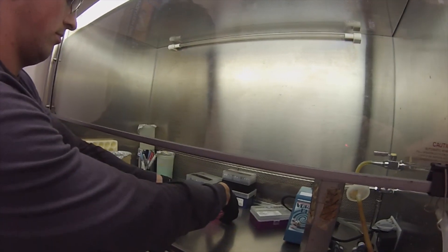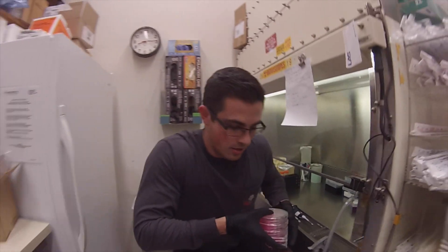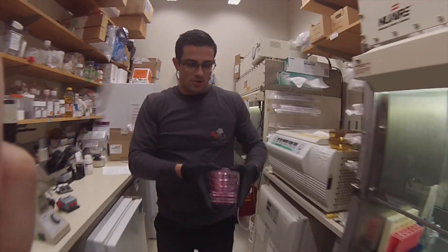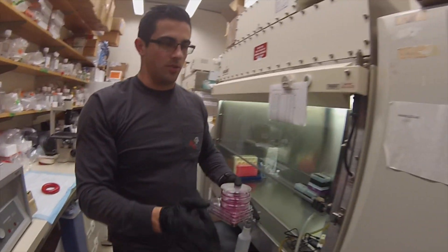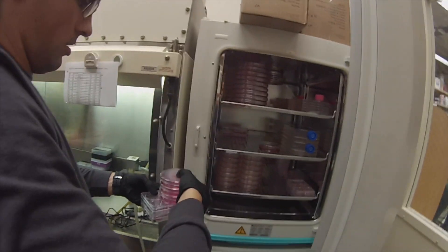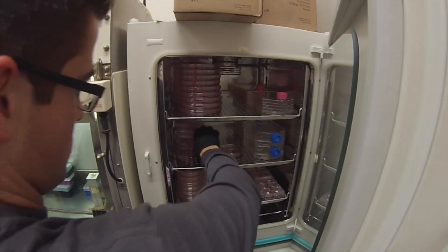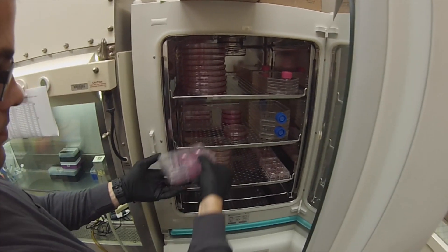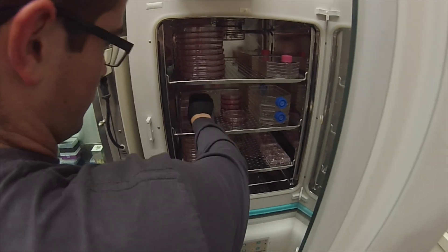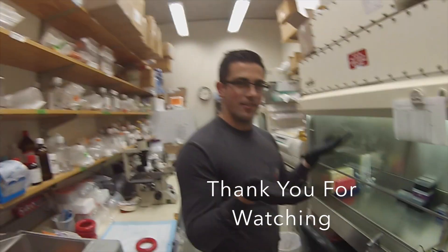After that, we just walk these over to our incubator, right there. And there you have it — how to split cells.